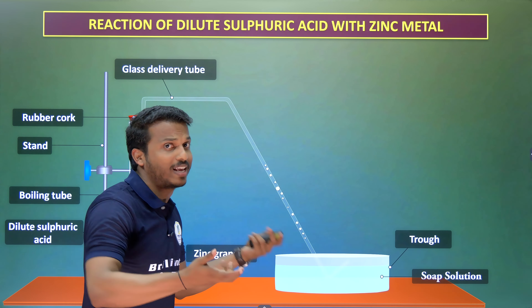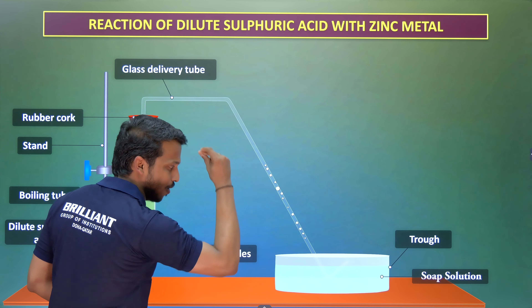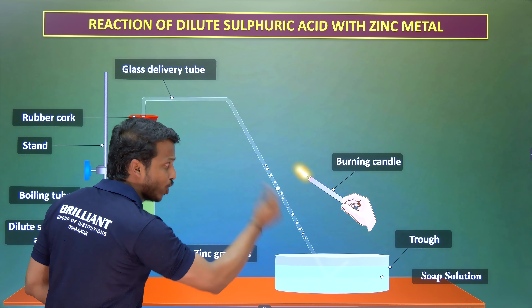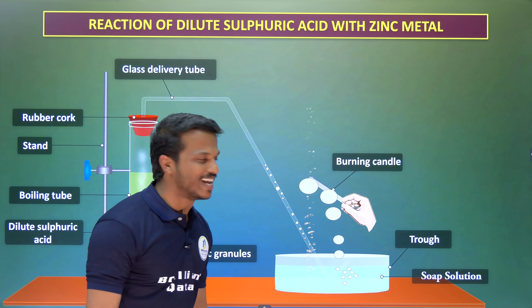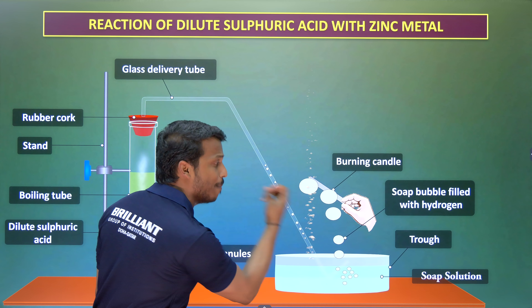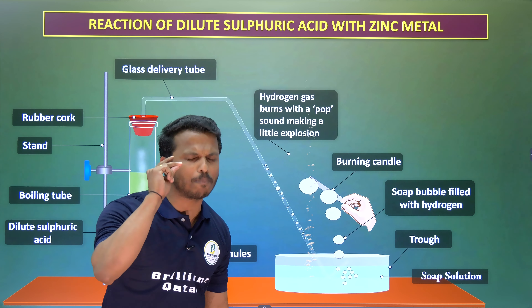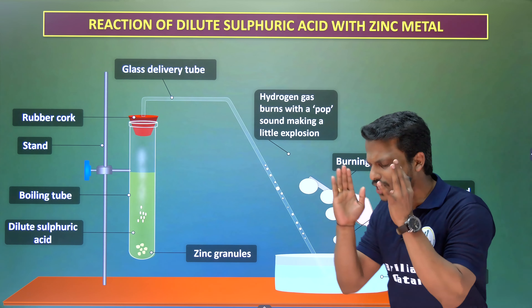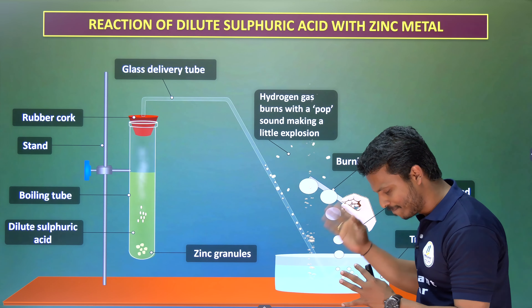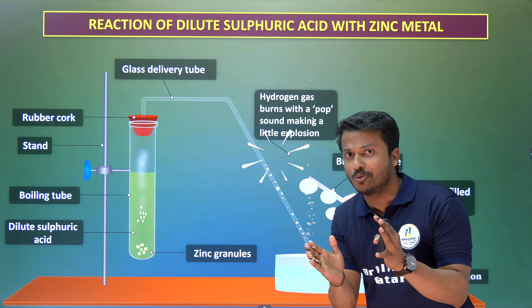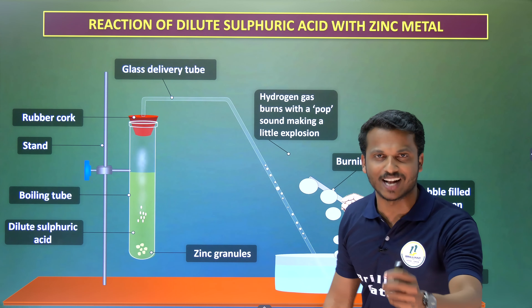One, two, three — boom! You can see some bubbles generated. These bubbles contain hydrogen gas. Please listen carefully — can you hear a pop sound? Yes, this pop sound indicates the presence of hydrogen gas.